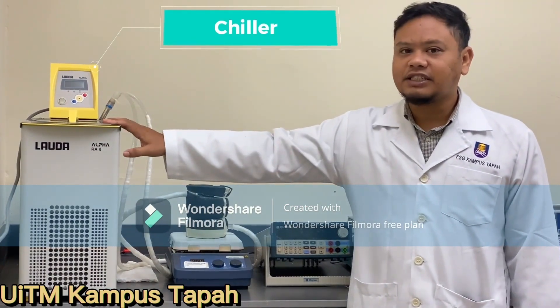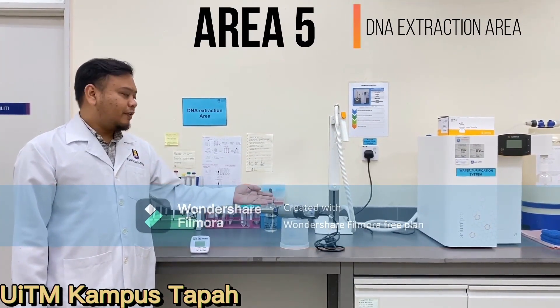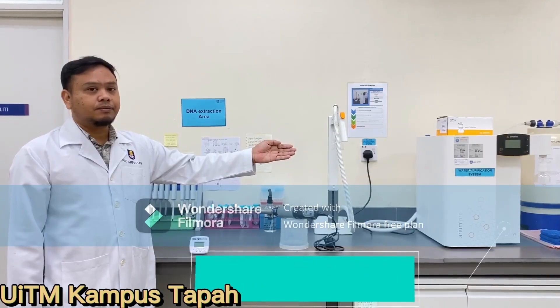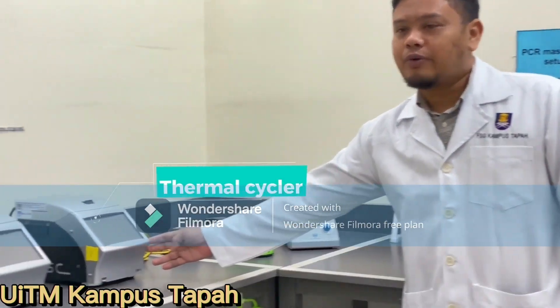And we have our refrigerated chiller. This is our PCR. This is our DNA extraction area. We have here our homogenizer and our water purification system. This is our PCR master mix setup, and here is our thermocycling area with our thermocycler.